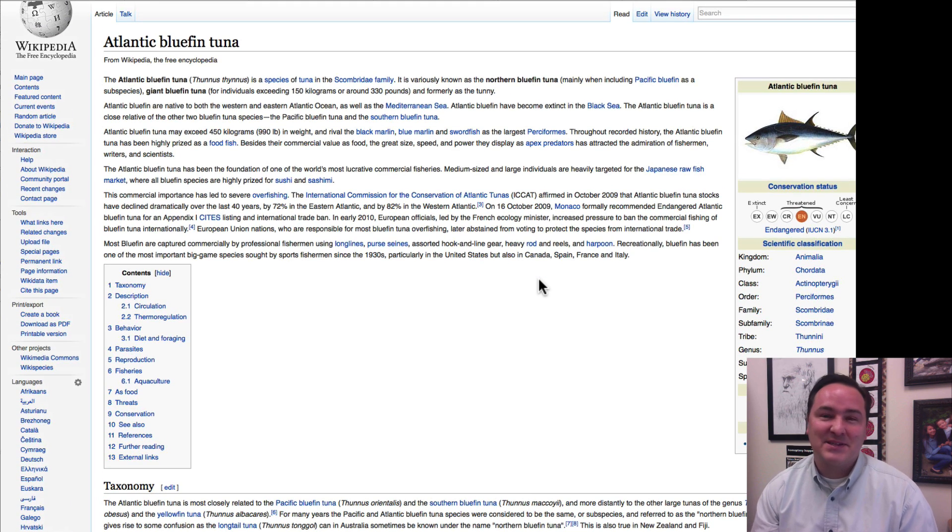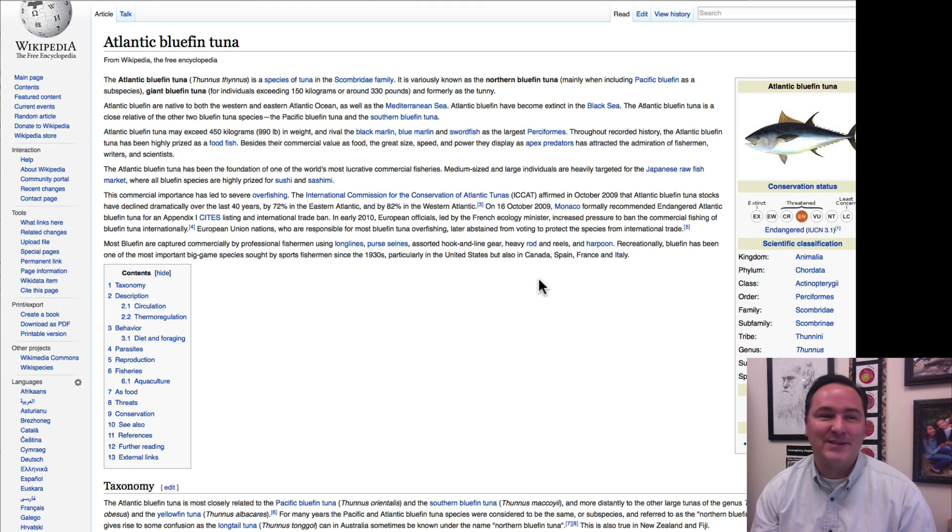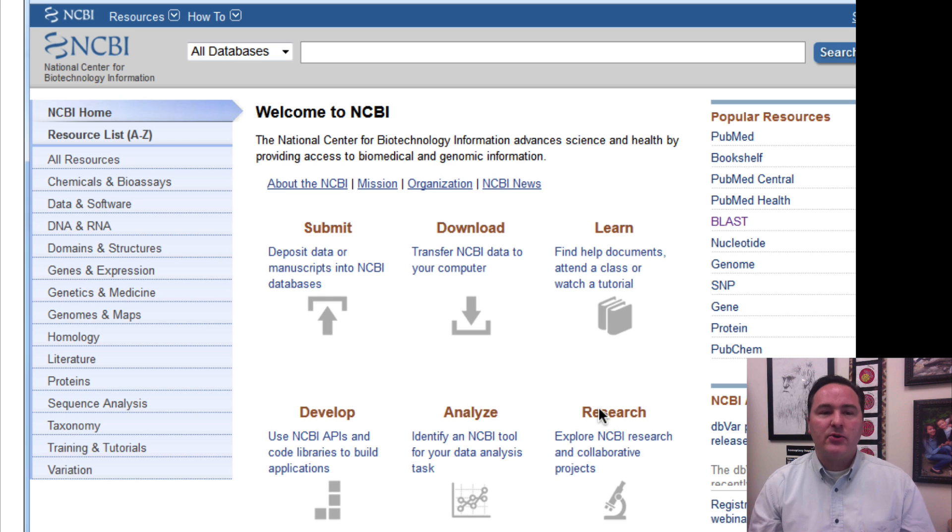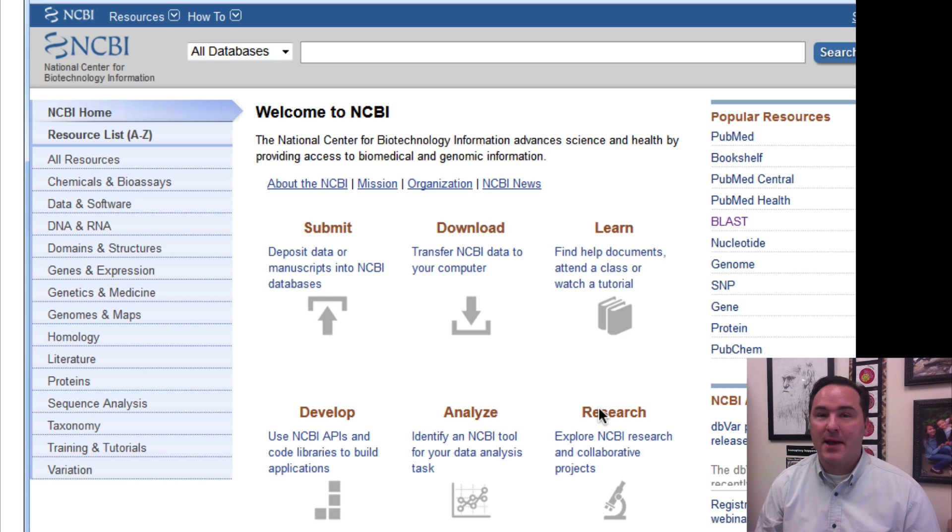And that's the, and so, that would have been the right species. You were eating the sushi that you expected you were eating. Okay, so, that's how you do a blast search.